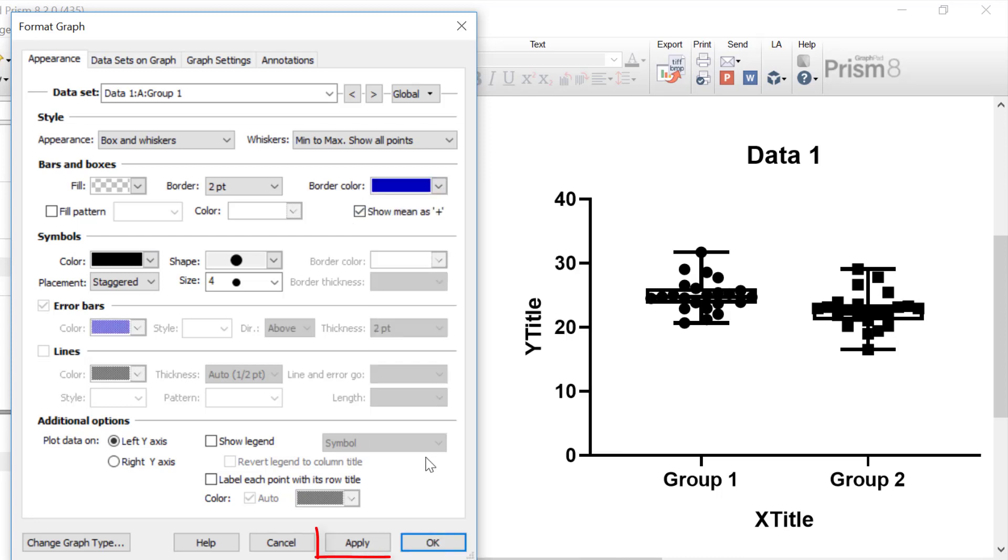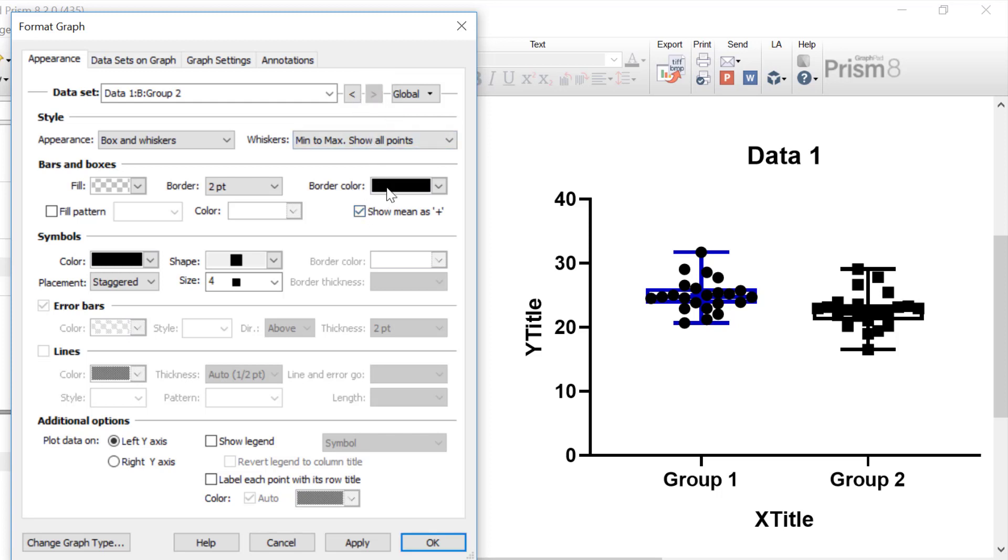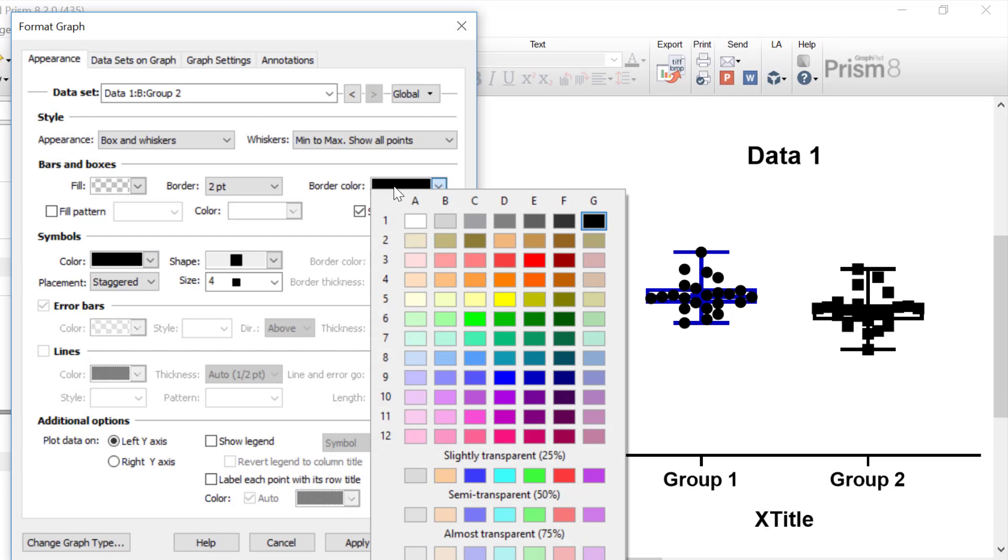And then what I'm going to do is click the apply button to preview my changes. So it's worth mentioning here that you actually won't see the plus symbol within the box and whisker plot currently. And that is because it's dominated by the superimposed data points. So I will adjust this afterwards. I'm just going to toggle to my second group and I'm going to also show the mean as a plus symbol on this. I'm going to change the border color to a purple color. And then click the apply button.